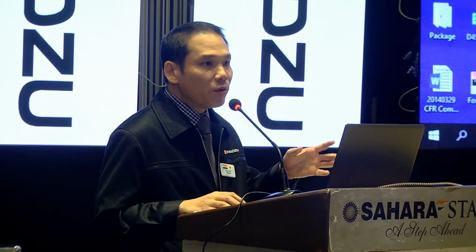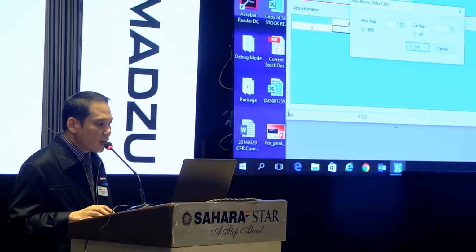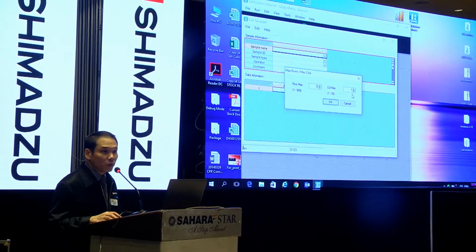So now I give you a demo on creating a new template. You can create as many templates as you want according to your customer requirement. For the new template, you can edit how many rows you want and how many columns you need.